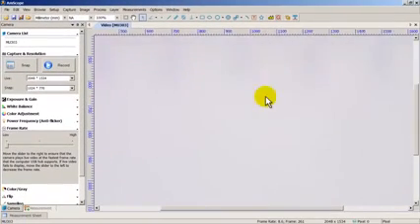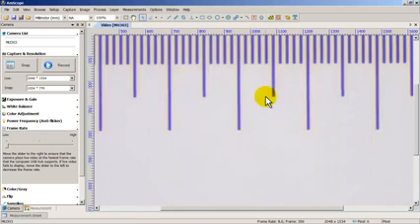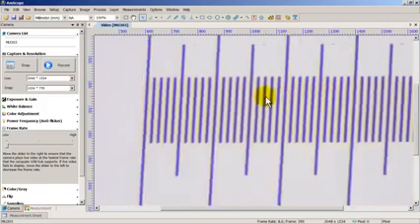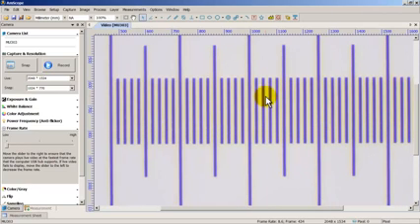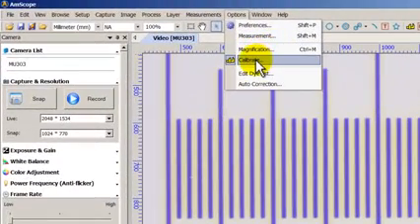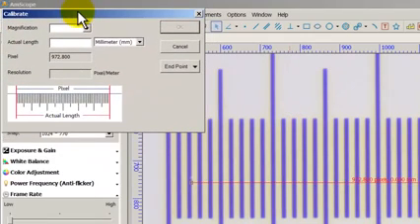Now it's a little bit blurry again. So I'm going to go ahead and readjust my microscope so that it's in focus. There you go. Okay. And again, I'm using the gliding table just to move this around. Alright. That should be good. So from here I'm going to go ahead and click Options, click on Calibrate. And right now I do have the 10x objective again.